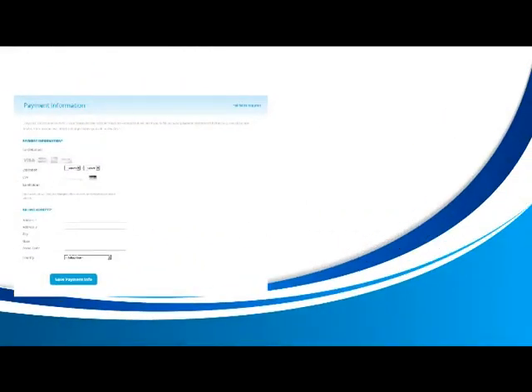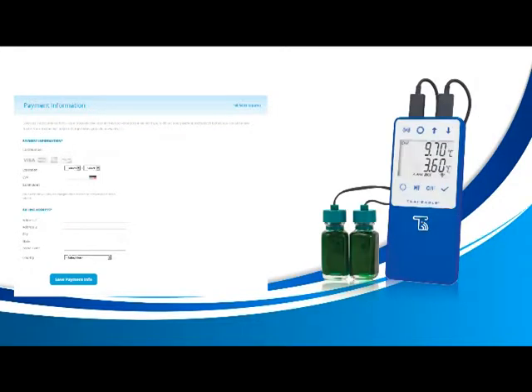Step 3: Enter Payment Information. For this step, you'll need to insert your credit card information. This credit card will be used when you begin to add Traceable Live devices to your account. At this time, no charges are being made as we aren't adding devices. When you arrive to step 8, we'll go through the steps on adding a device and there it will explain what charges will happen at that time.